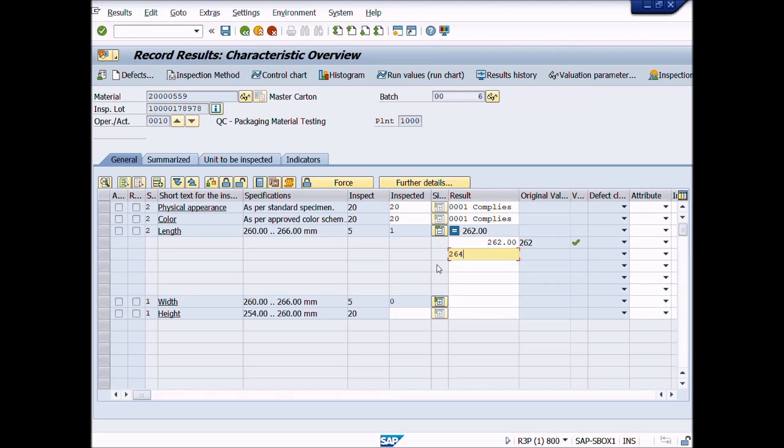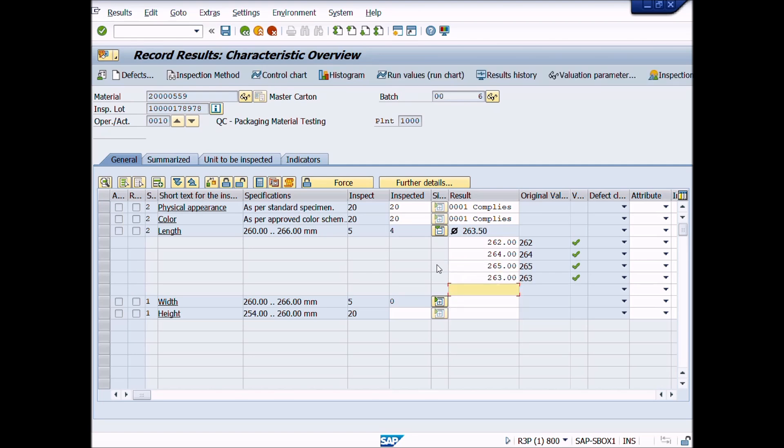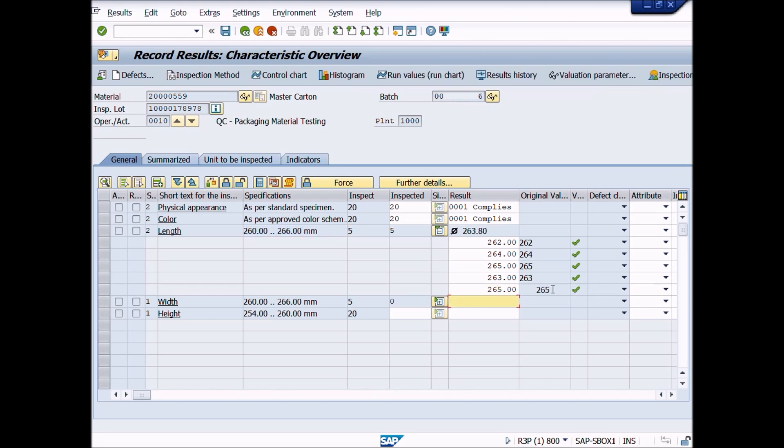You notice here that the values meet the inspection criteria or according to lower or upper limits. The system valuates these results values as right or wrong by displaying the right or cross symbols. We have entered five results values for this characteristic and the system calculates average value automatically. Here you can see it. Now press minus sign button to close the results values section.